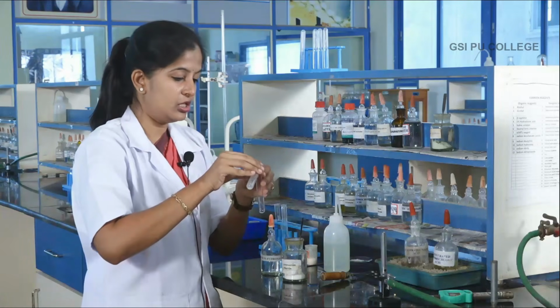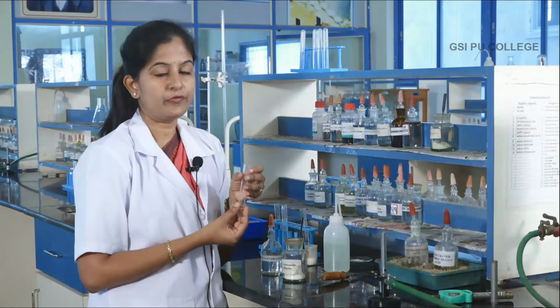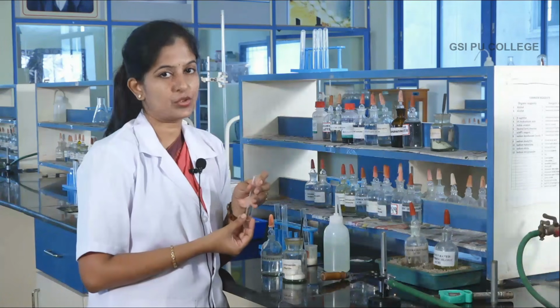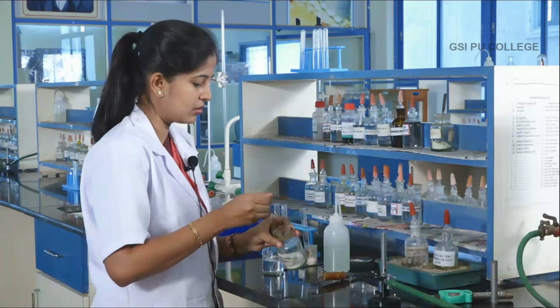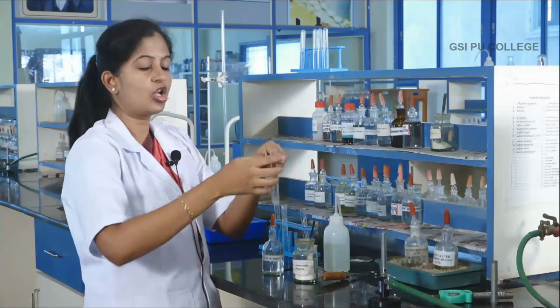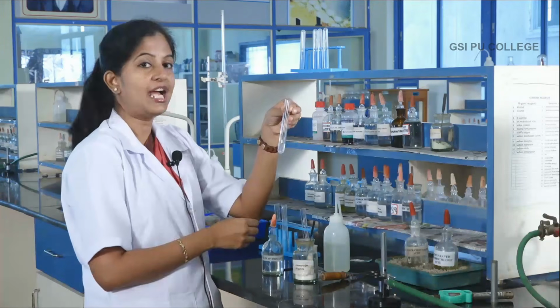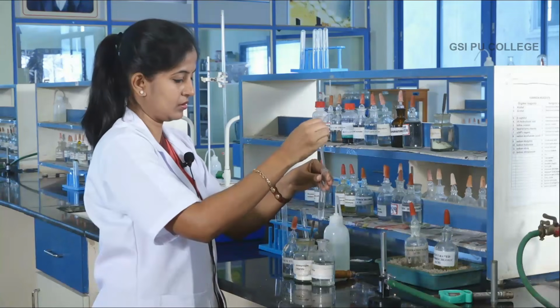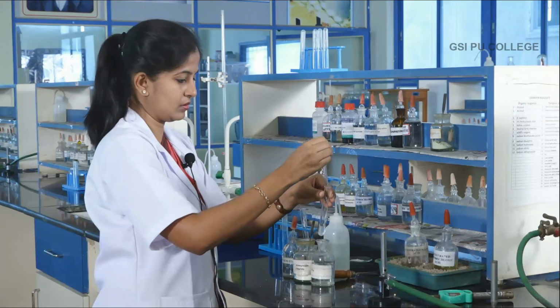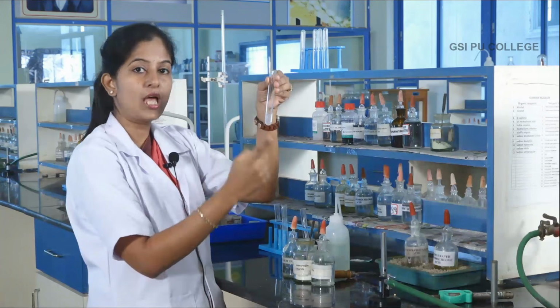Decant a small amount of original solution. The group reagent for the fourth group basic radical is ammonium chloride followed by ammonium hydroxide plus H2S in excess. So, that is your group reagent. Add a pinch of ammonium chloride first. Solubilize the ammonium chloride completely. Add ammonium hydroxide. Add H2S in excess. You can observe that there is no precipitation, which means that the fourth group basic radical is also absent. Hence, we have to move on to the fifth group basic radical.